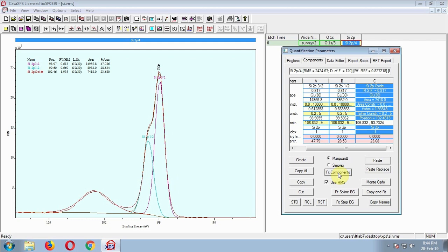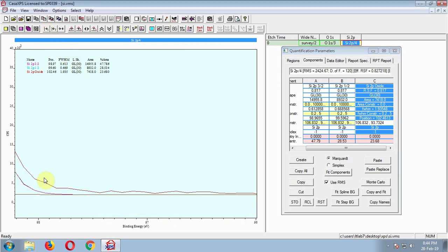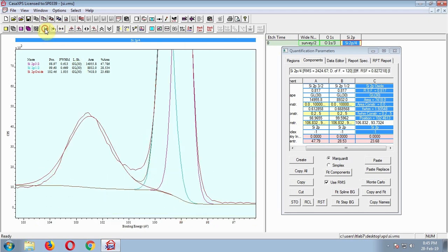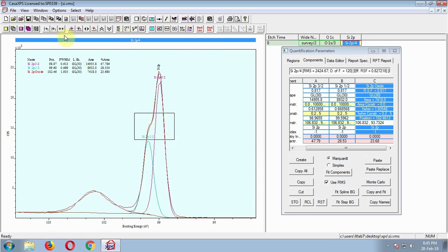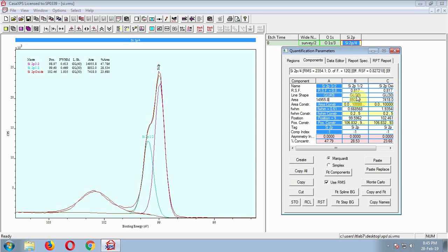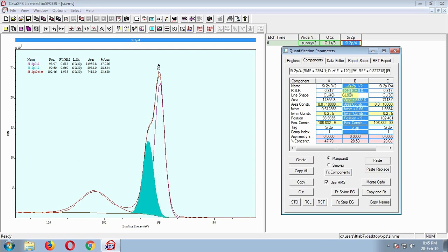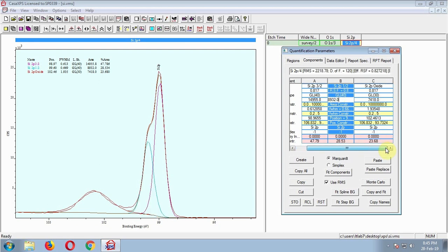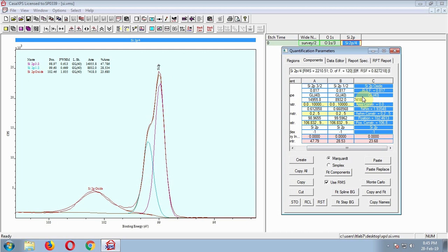Well, we can improve it. Look at the envelope and the data — try to find where the gaps are between those. We can increase the Gaussian contribution, increasing from 30 to 40. Seems better. Let's do it for the other two also. Then fit these. Looks better.